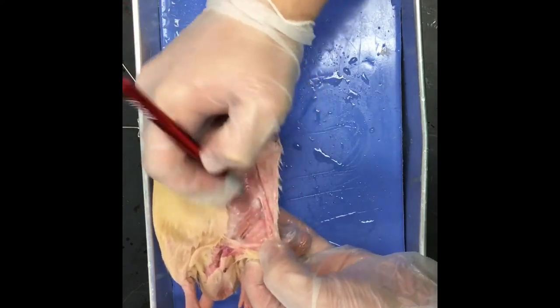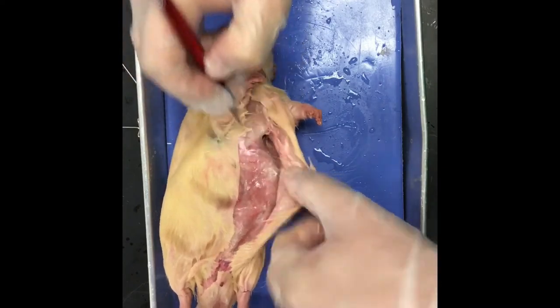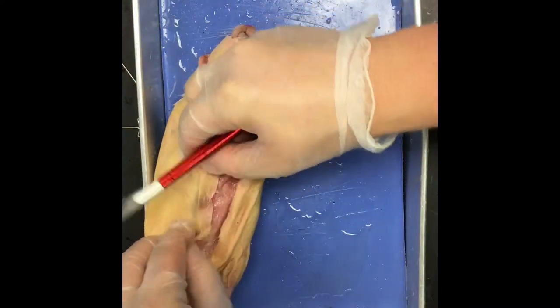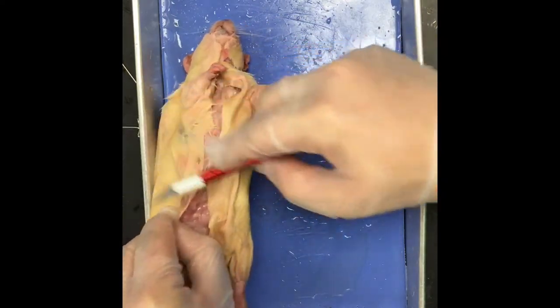This right here, you're gonna go through, and you're just flaying away the connective tissue. It's like filleting a fish or something. Chicken. A little different. Close. Well, hey, fish is good.